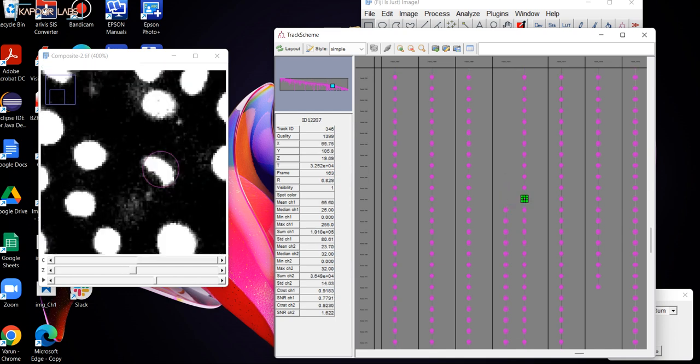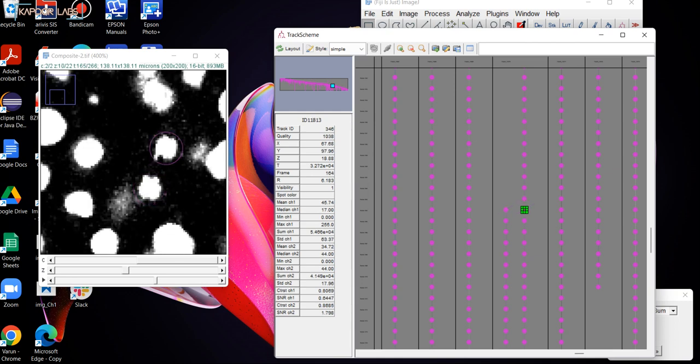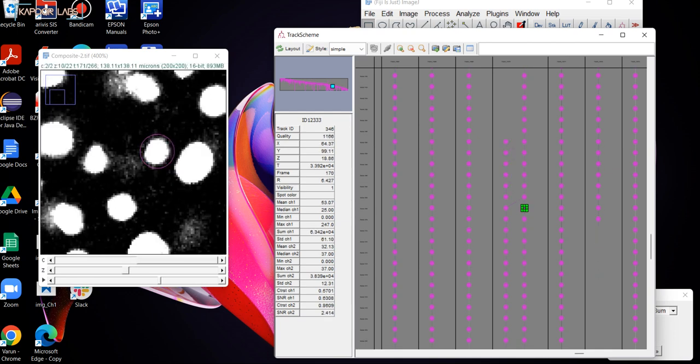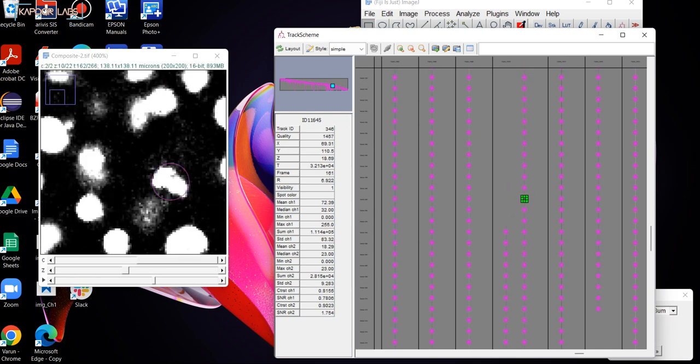So you don't have to correct for these kind of mistakes, because how I'm doing it here is I identify the position of the mother cell from ONeat. Then I ask ONeat to take this mother cell and look in the next frame what are the closest cells that can be linked based upon the size constraint and the distance. And then based upon the cost that the local segment to segment linker calculates, it is able to find proper links to make between the mother and the daughter cells. So you have then nice long lineage trees where the mitotic cells have been identified correct.